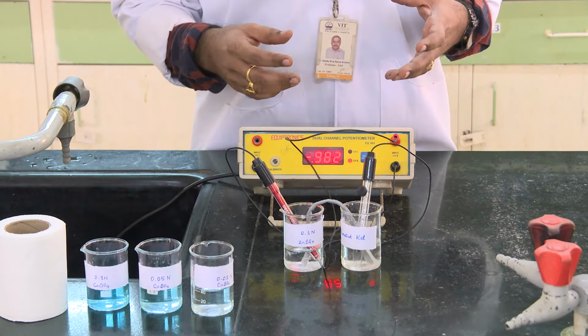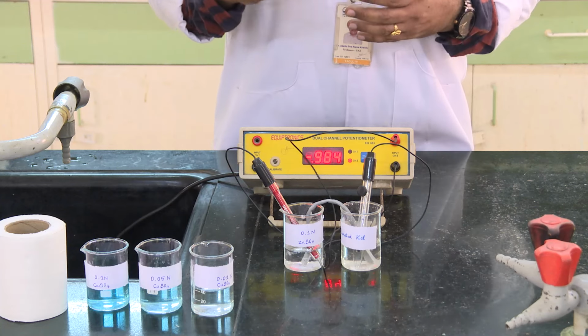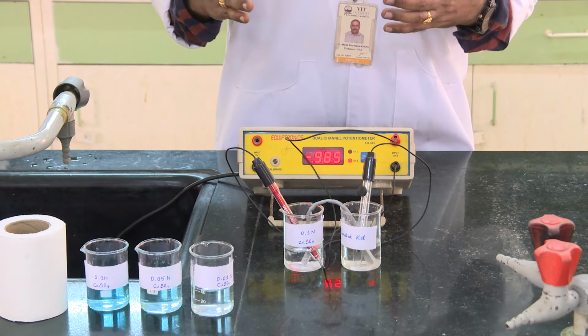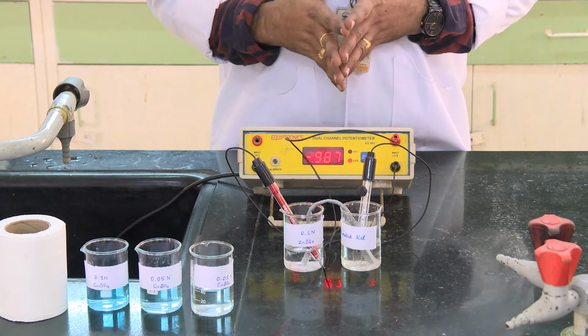After that, we are going to put these results in table form, and then use the Nernst equation to make the complete cell reaction, with respect to the calomel electrode as a kind of reference electrode.